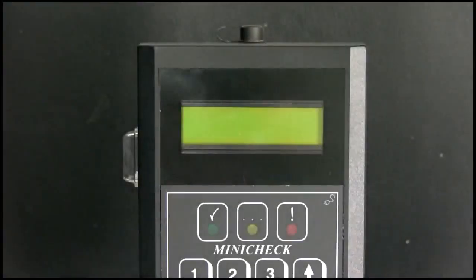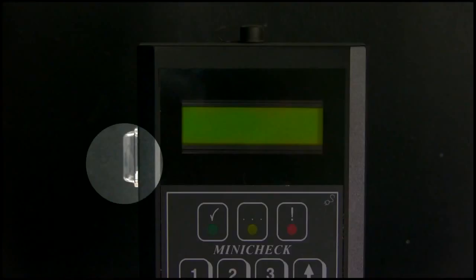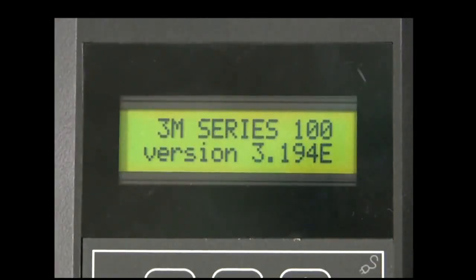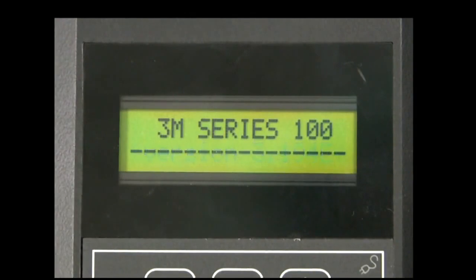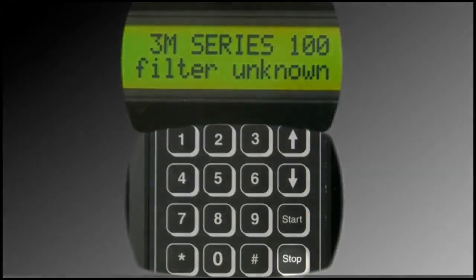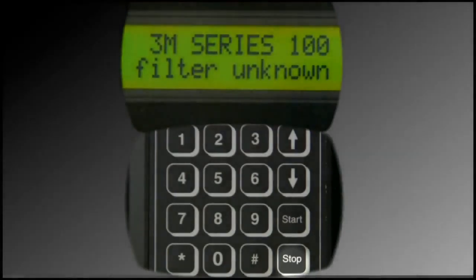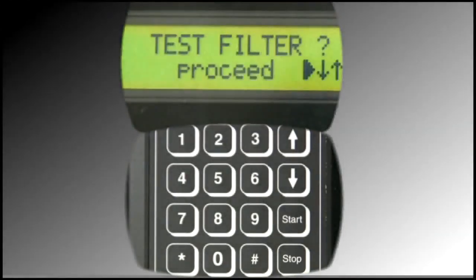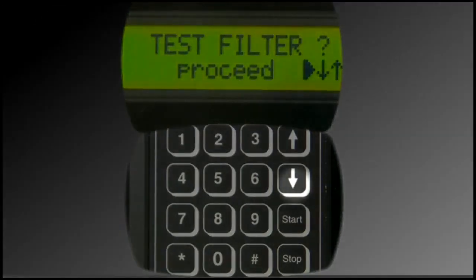To access the service menu, first activate the device by pressing the on button. A series of messages displays including the latest version information. It will then note the last test program used or display the message Filter Unknown. Press Stop on the device keypad, followed by the down arrow until Service displays on the screen.